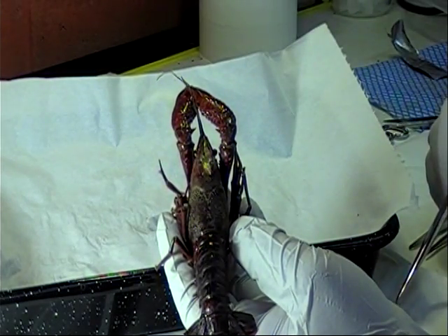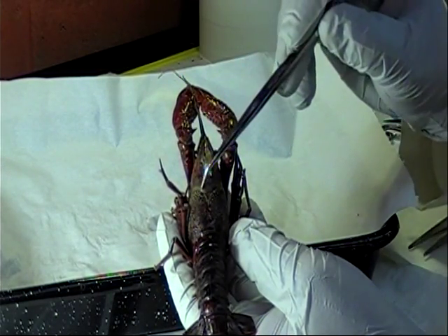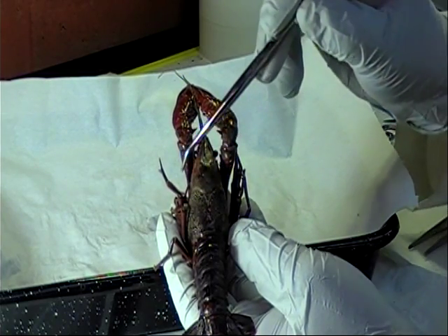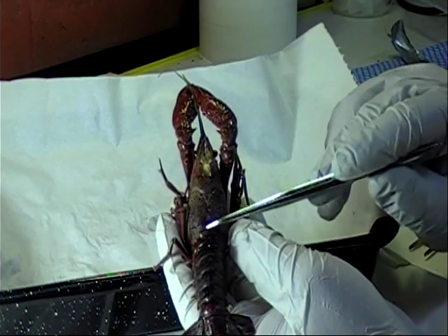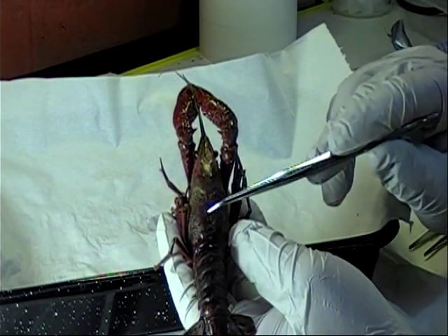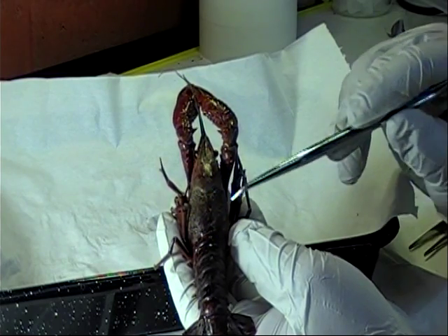On the cephalothorax carapace, you can see the cervical groove, which separates the head from the thoracic region. You can also see a prominent indentation on the cephalothorax carapace that defines the central area and separates the two sides of the thoracic region.